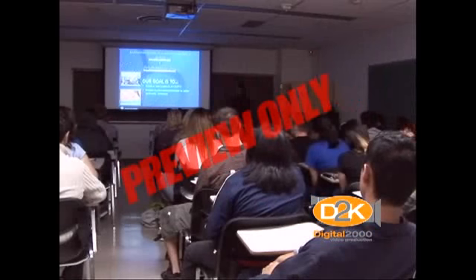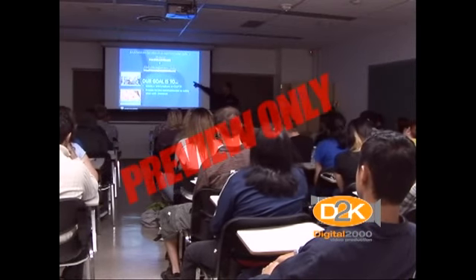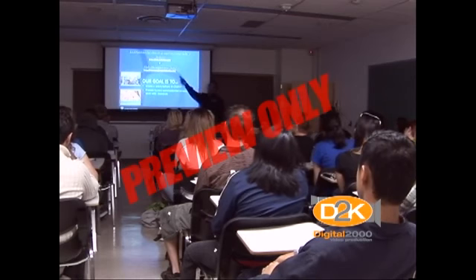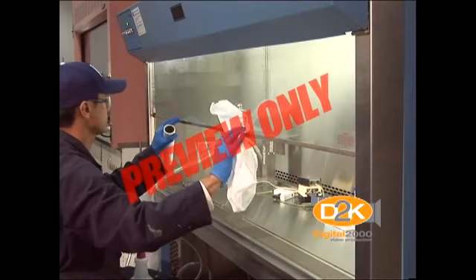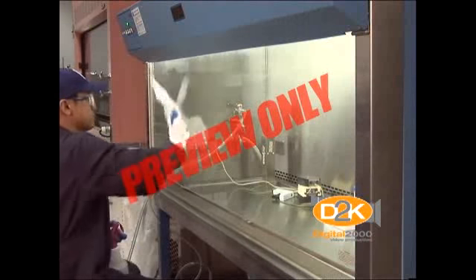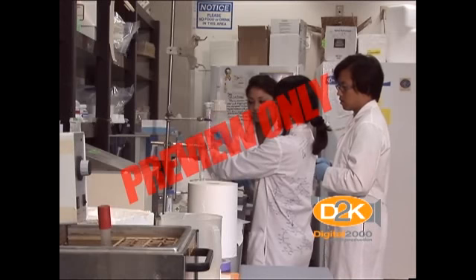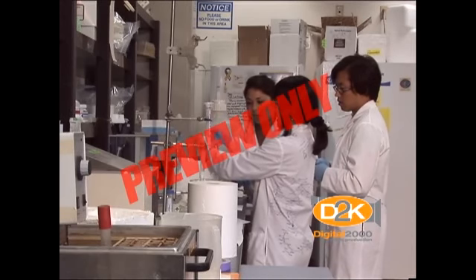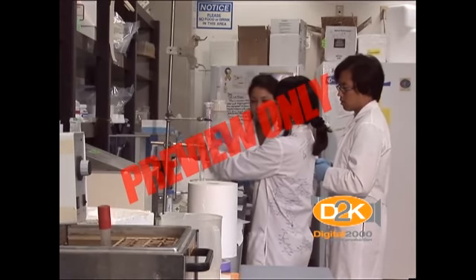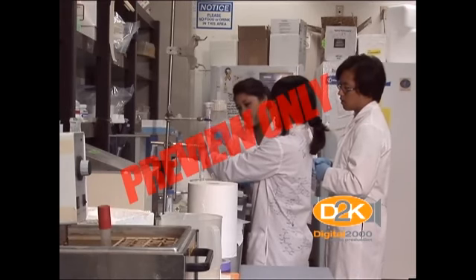All personnel working in laboratories or facilities where biological materials are used or stored must receive biological safety training before starting work. This training must be renewed periodically and whenever procedures are changed. Biological safety training familiarizes you with common biological hazards, your university's biological safety program, and safe practices for acquisition, use, storage, and disposal of biological material.